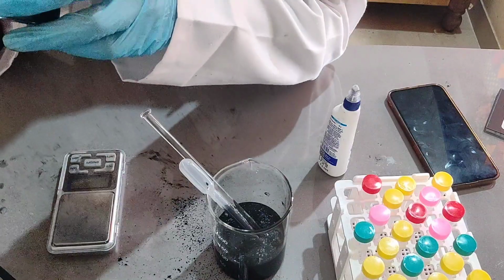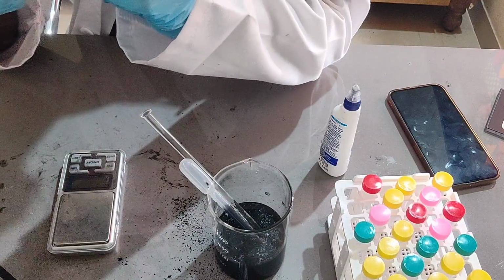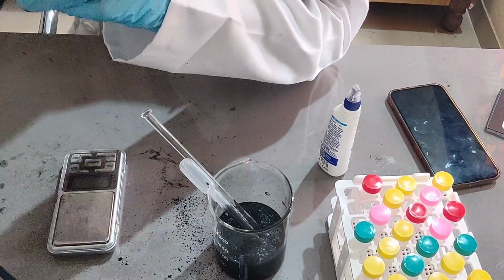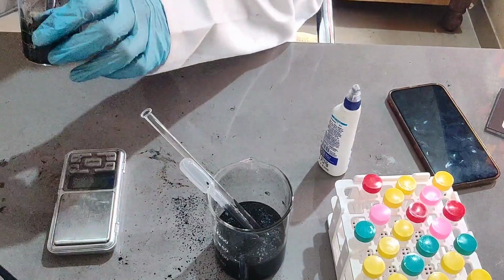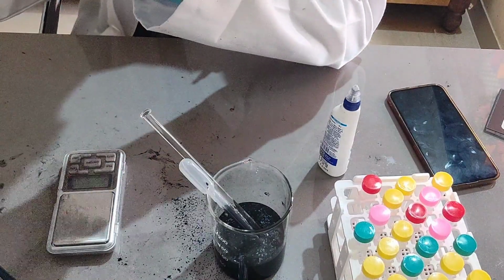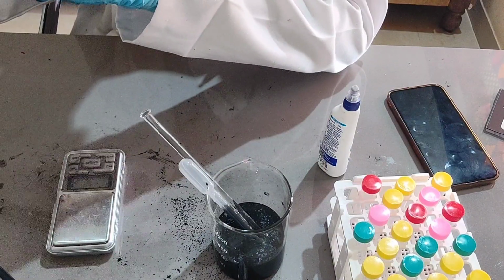The thing that appears on top of the suspension, I guess that might just be graphite as well as a little bit of PVA too. A mixture of graphite and PVA. That could be it, if I could get a sample. Oh, so the graphite has fallen out of suspension, only the one remaining at top being transferred to the glass one.